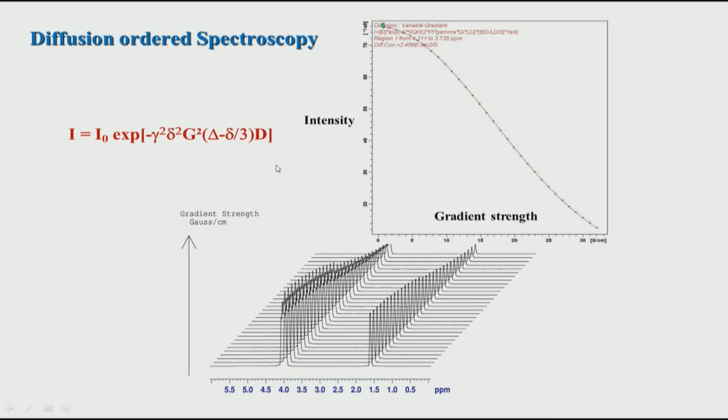Because of the small diffusion D, the phase values will change so much that rephasing will not help, because now the locations have changed. You need a very accurate repositioning for the rephasing. It will not rephase because the molecules have moved away. So, this is typically how the philosophy of DOSY works. Let us see how it manifests.